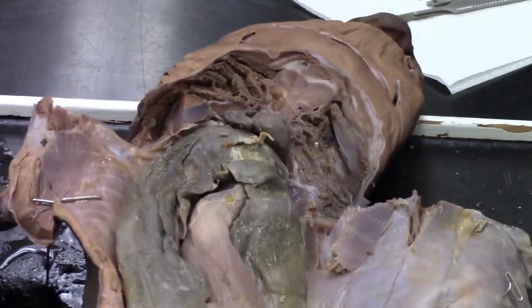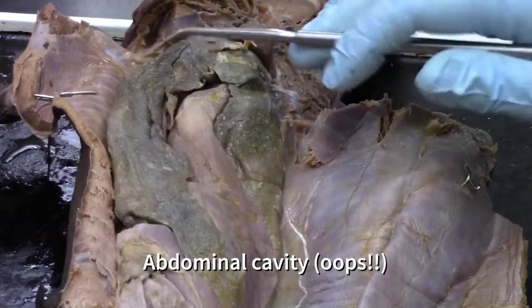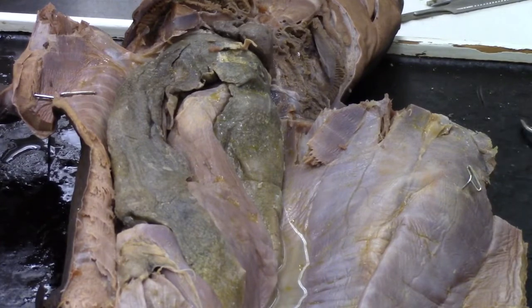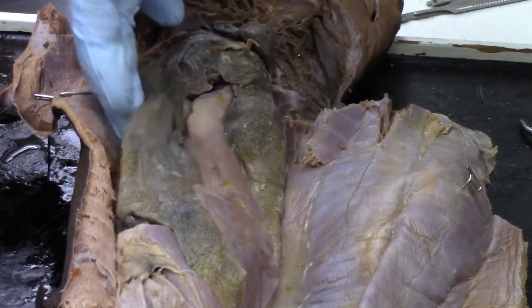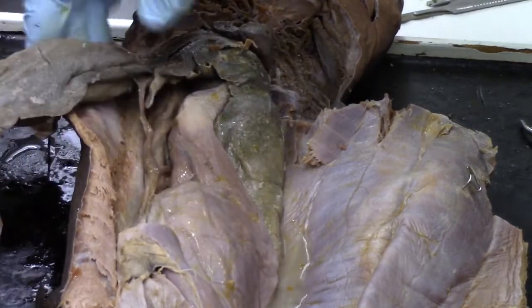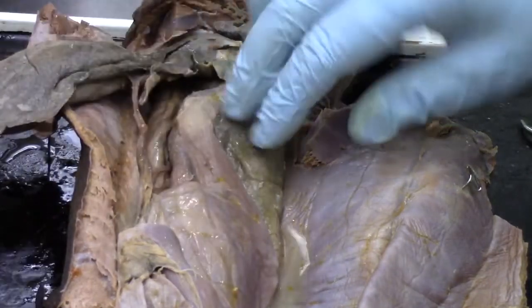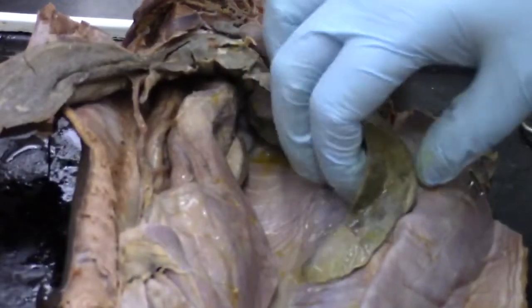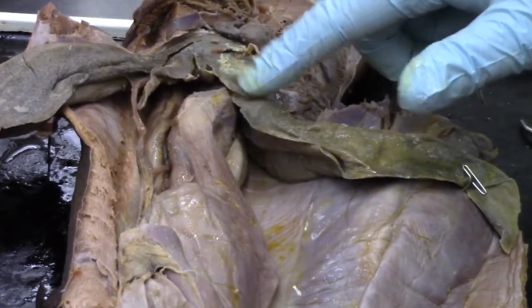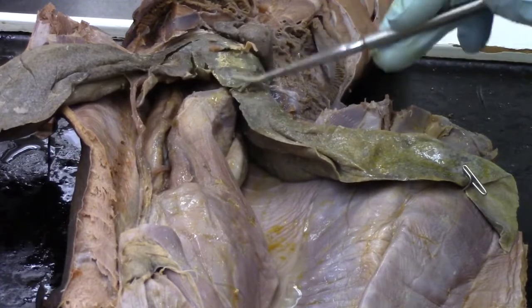Now we'll shift a little bit and start looking at what's in the thoracic cavity. So the large, usually grayish in color, this is going to be the shark's liver, and you're going to have to move some of it aside so that you can see the other parts. So this is one of the lobes. We have a second large lobe here that I'm just moving aside. And then we have a third lobe that's really quite small. We've got it up here.